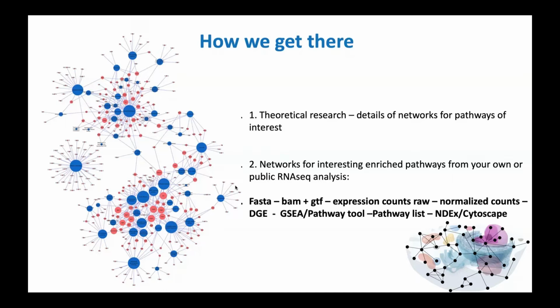From GSEA, or from other tools, you will get a list of pathways altered in your experiment. And then we handpick pathways which we think are of interest, which are changed to the largest degree, and we take them to NDEx.